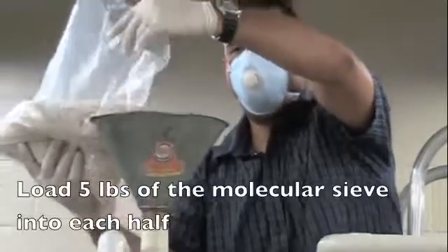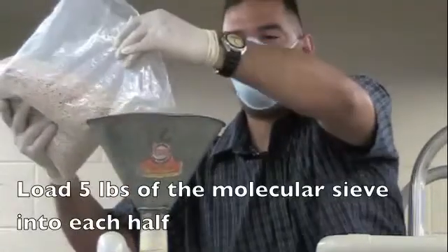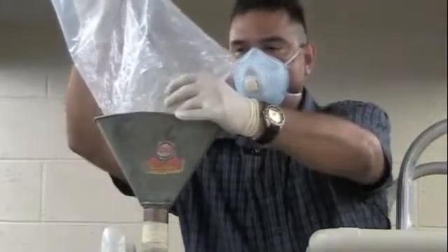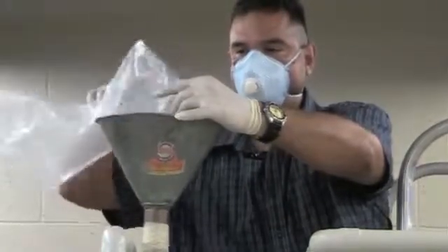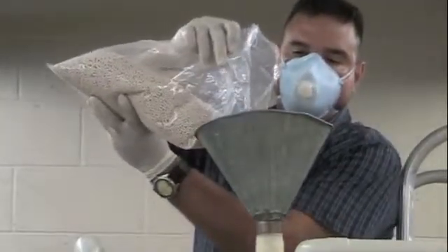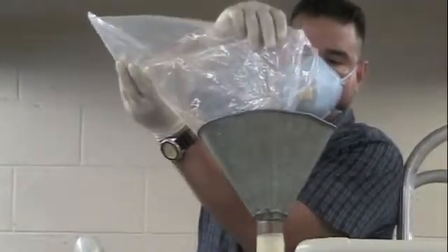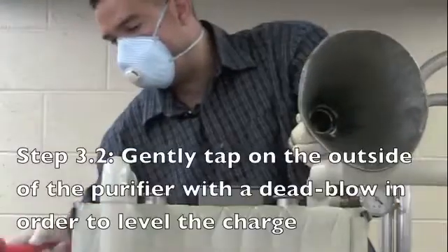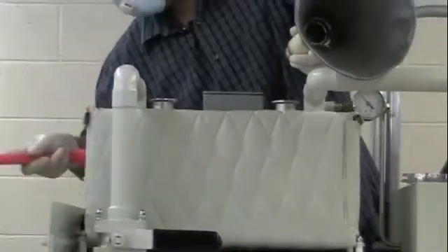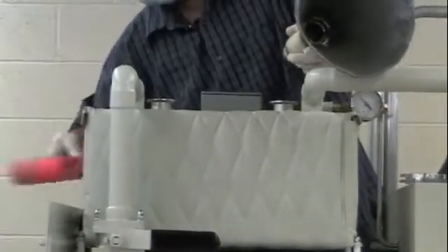Load 5 pounds of the molecular sieve into each half of the purifier. Load another 5 pounds of the molecular sieve to the second half. Gently tap on the purifier walls with a dead blow to level off the charge. This accommodates more room for the other charge to be loaded.